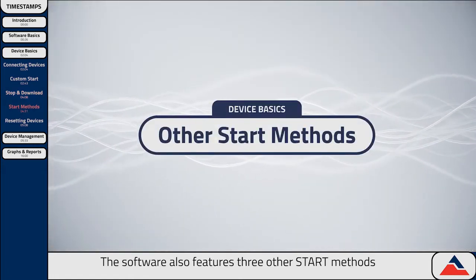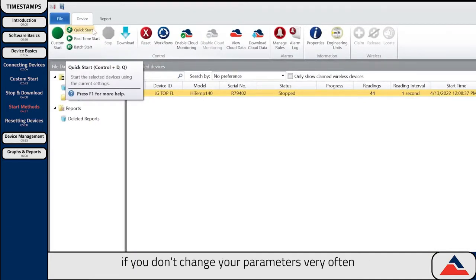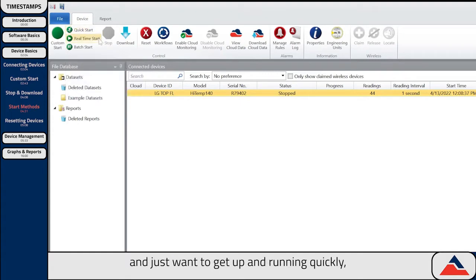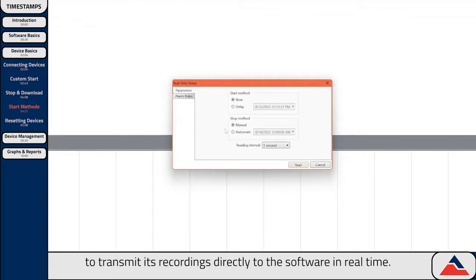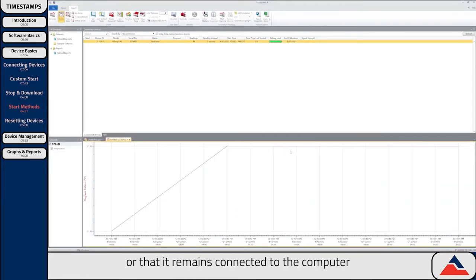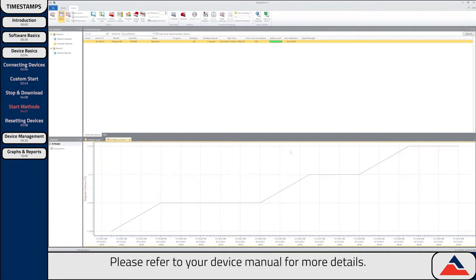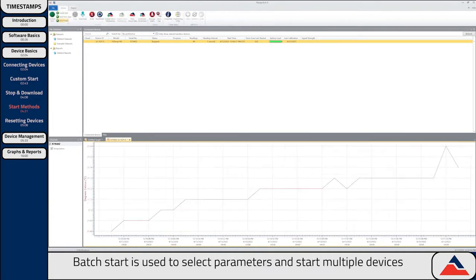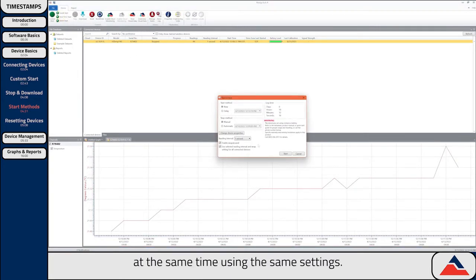The software also features three other start methods. Quick Start will start your device using the most recent Custom Start settings. This is great if you don't change your parameters very often and just want to get up and running quickly. Realtime Start will ask for your parameters similar to Custom Start, but will arrange for the device to transmit its recordings directly to the software in real time. This function requires that your device either has wireless functionality or that it remains connected to the computer during the recording. Batch Start is used to select parameters and start multiple devices at the same time using the same settings.